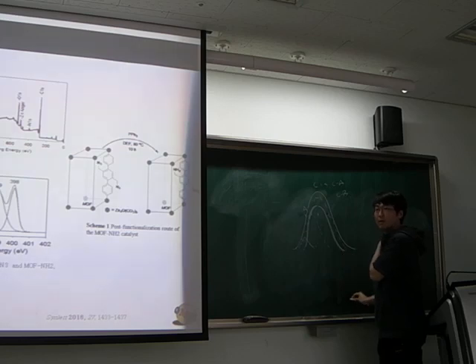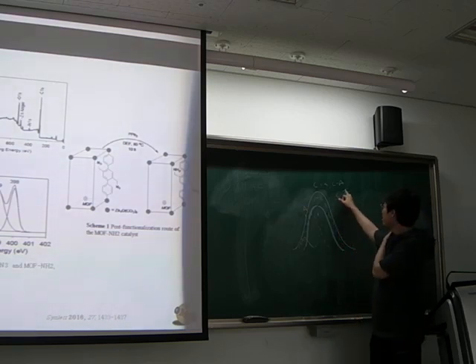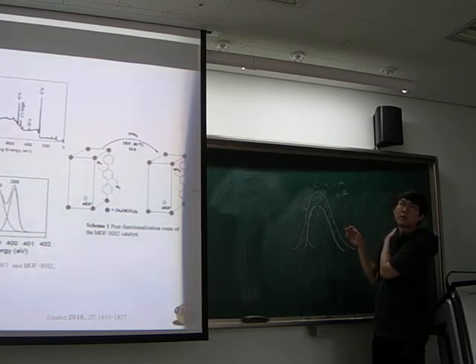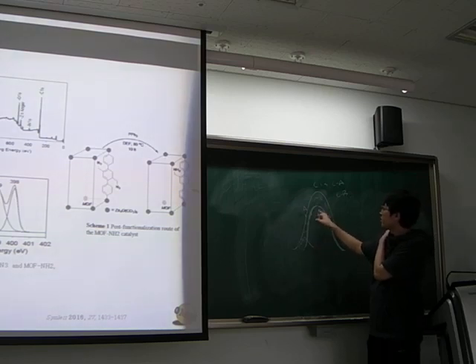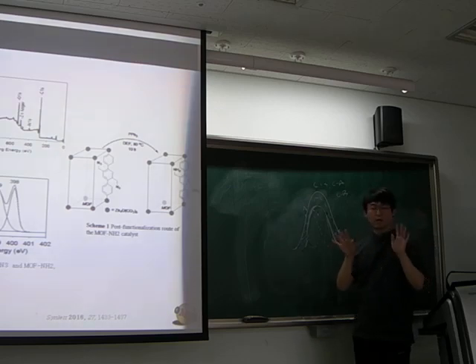만약에 1대1이 아니라면, if this is not 1-to-1 ratio, then you have some difference as he just drew. If the CA and CB content is not 1-to-1 ratio, this position is not located on here. It will change its position. It is automatically located here. So when you do calculate, you can estimate this area and you can compare with this ratio.